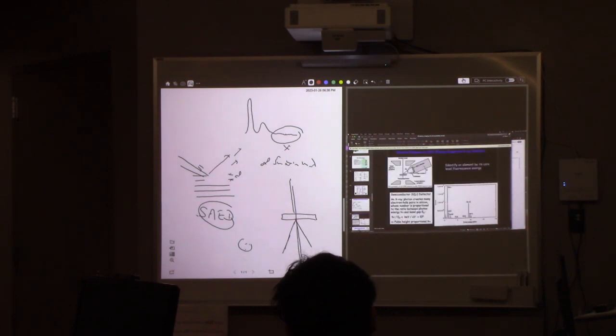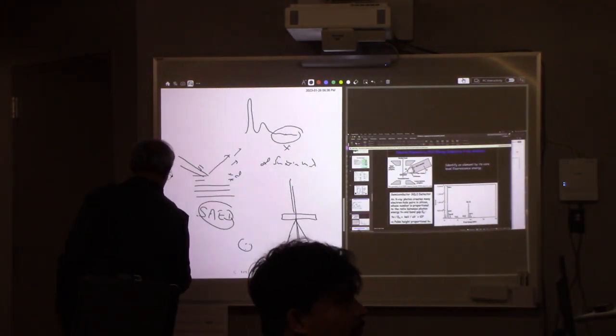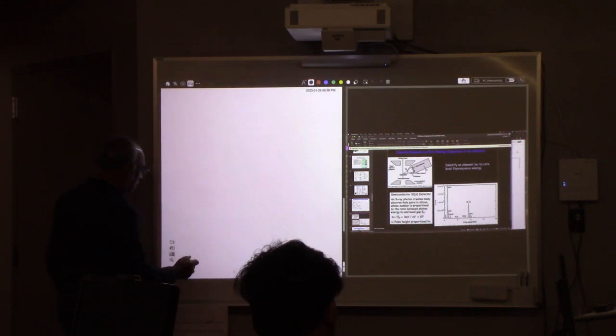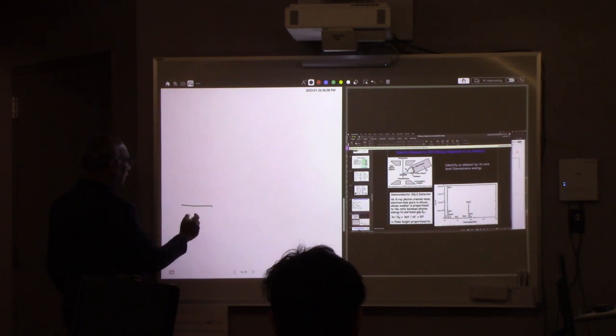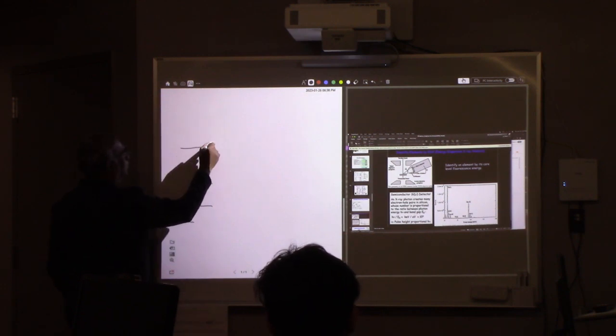Okay, so these are the basic things. Here is the EDAX thing I was talking about. You have to have this EDAX detector, right? You can see here how we are looking at this. When you do that, you can see peaks corresponding to gallium L, aluminum K, these things. Everybody knows, right? Typically, your energy states start with K, then L, M, like that.